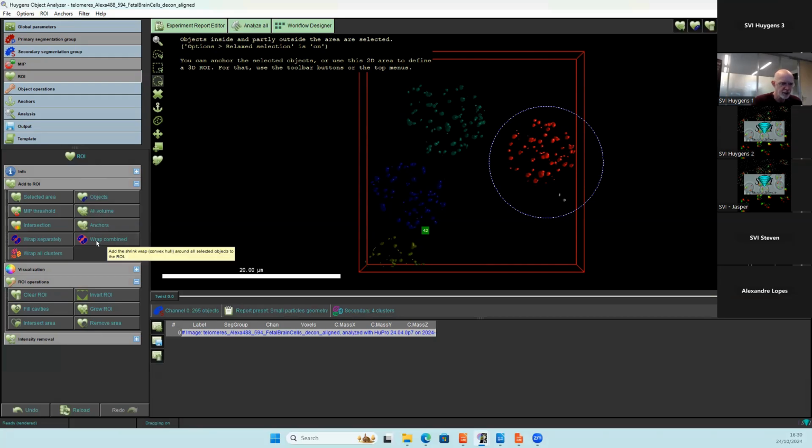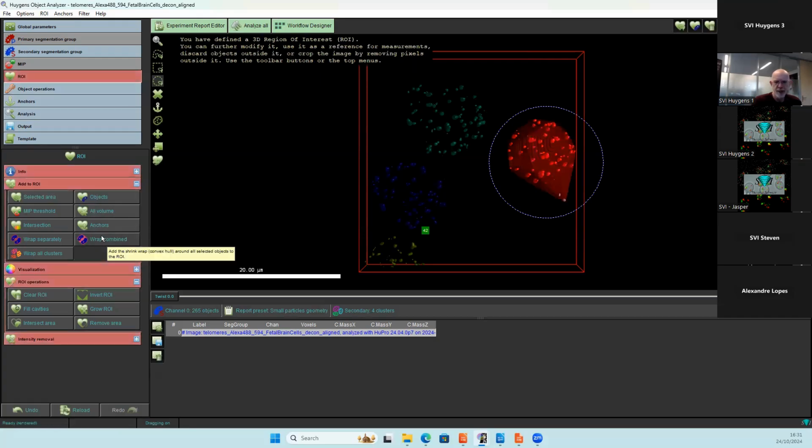There are 9 different options, and it's the last one in the first section under add to ROI. So ROI, add to ROI, and then wrap combined. And also in this case, you see that it's completely wrapped, and we can analyze, of course, this volume.